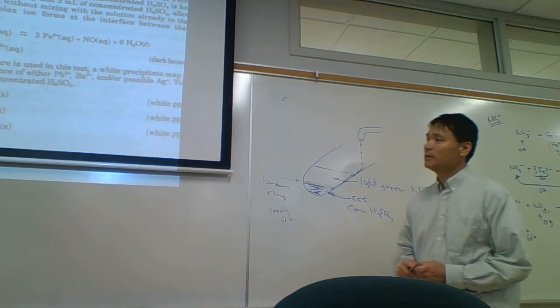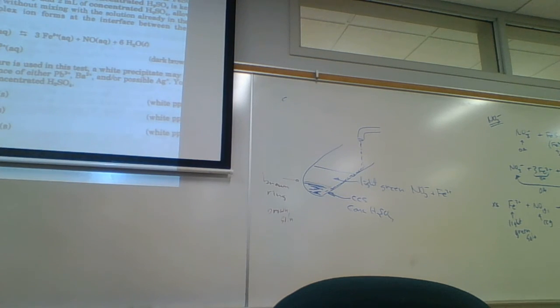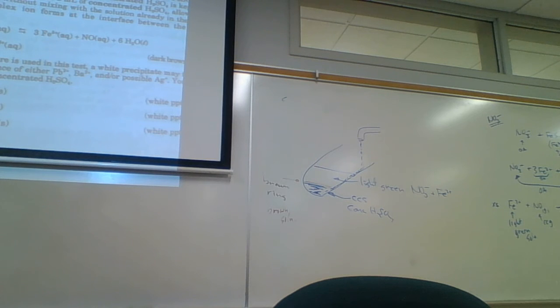All right, so some of the chemical hazards here are concentrated sulfuric acid causes severe burns. Sodium bismutate is a powerful oxidizer. Permanganate's a powerful oxidizer, so avoid contact with those. What else is hazardous? Silver nitrate is hazardous. What does silver nitrate do? Yeah, and at high concentrations, it causes burns and blisters, chemical blistering.